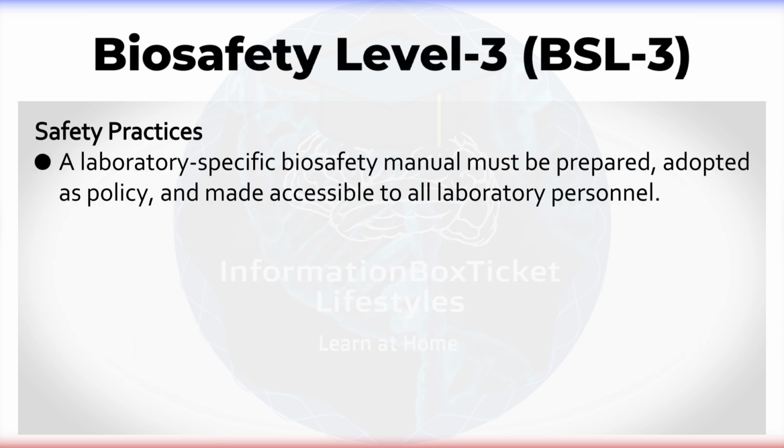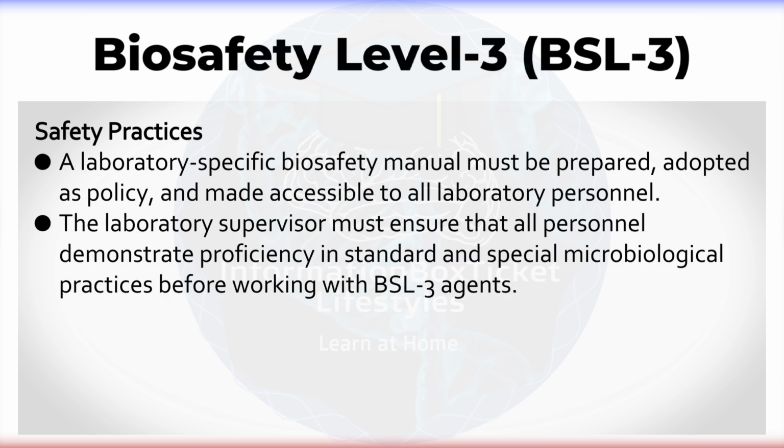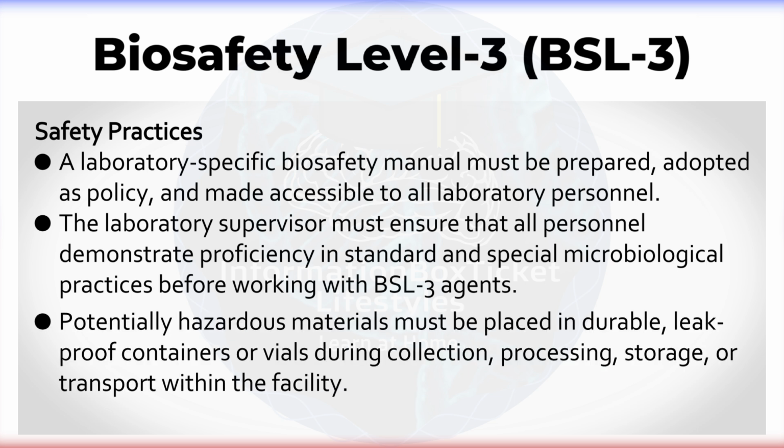A laboratory-specific biosafety manual must be prepared, adopted as policy, and made accessible to all laboratory personnel. The laboratory supervisor must ensure that all personnel demonstrate proficiency in standard and special microbiological practices before working with BSL-3 agents. Potentially hazardous materials must be placed in durable, leak-proof containers or vials during collection, processing, storage, or transport within the facility.